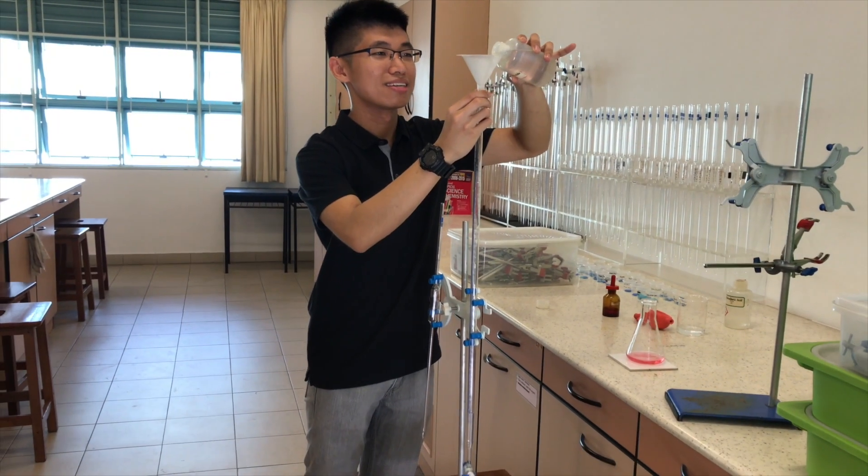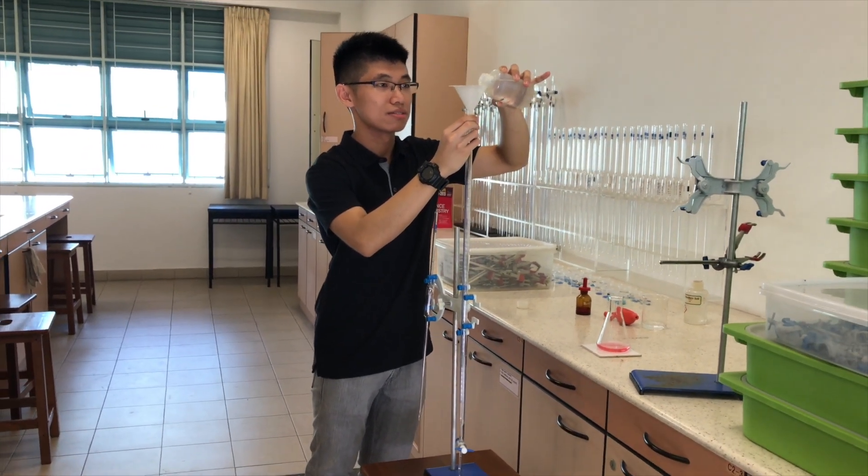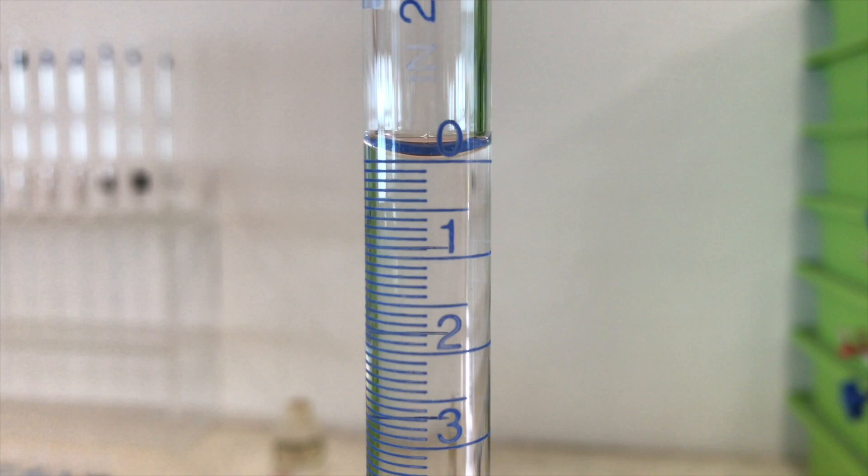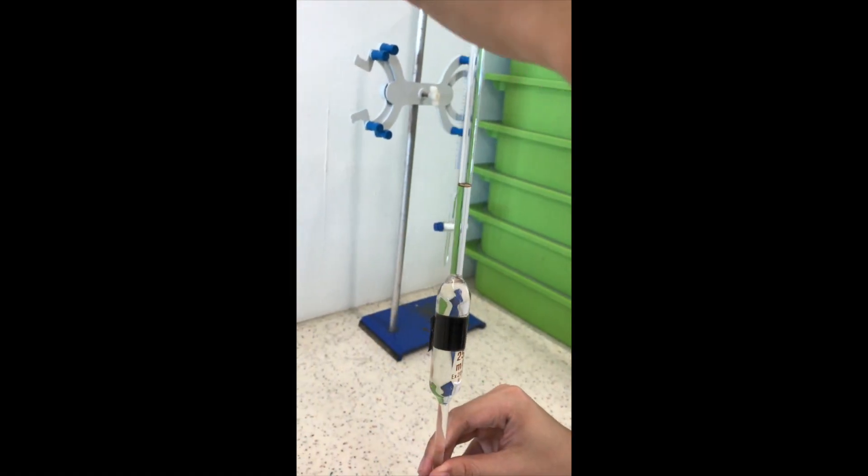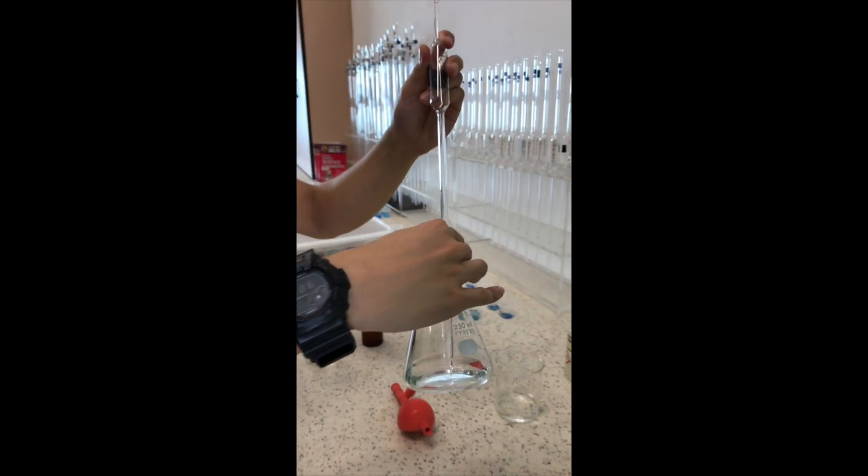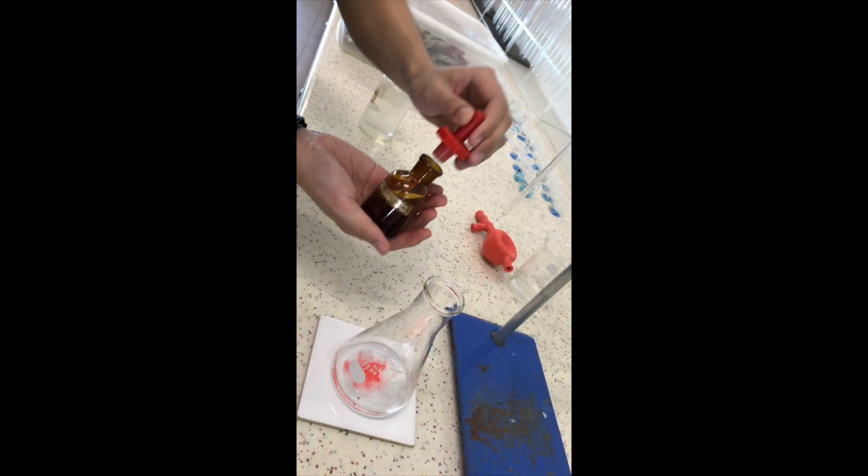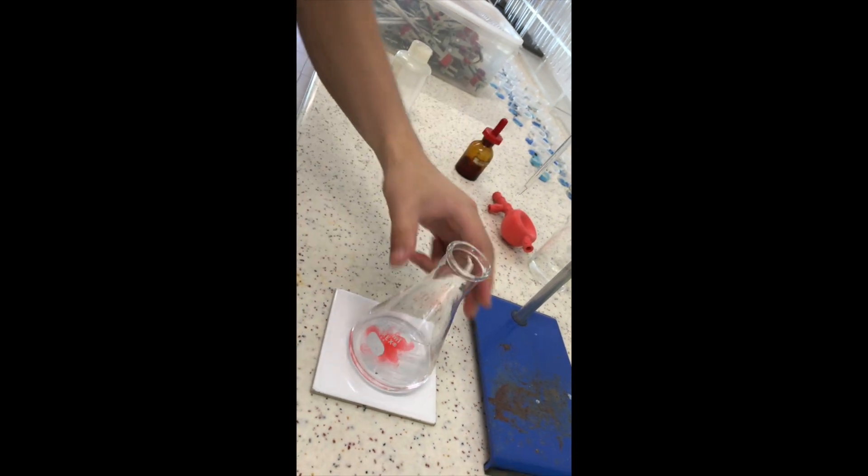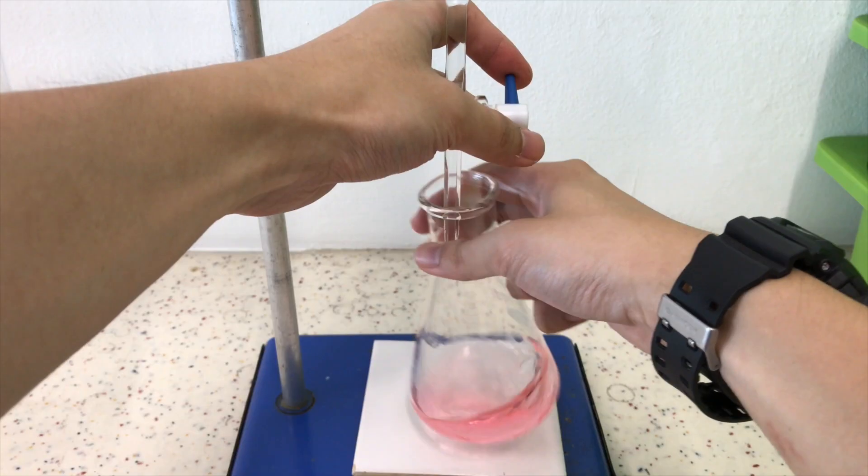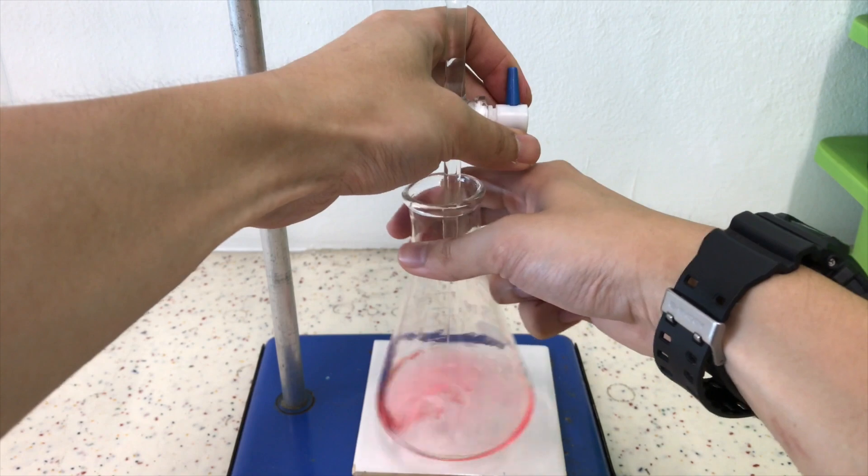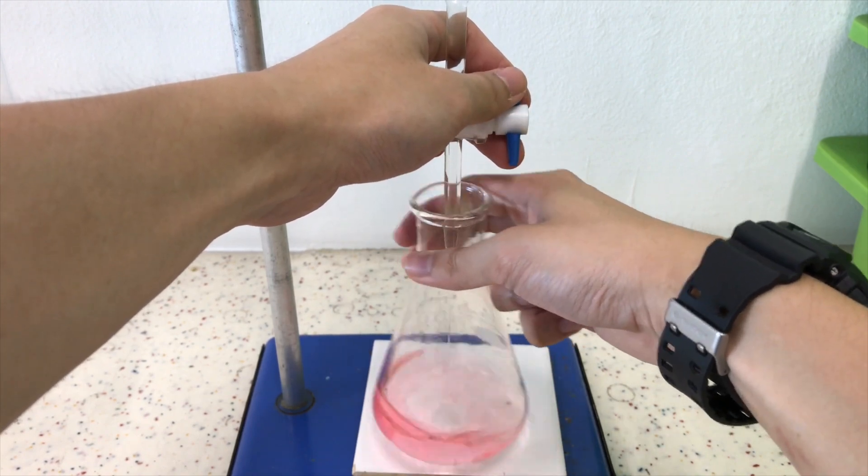Step one: we fill a burette with sodium hydroxide and take note of the initial reading. We will pipette a fixed volume of acid into the conical flask, usually we use 25.0. Always remember to add the indicator because that will tell us how much of the alkali we will need for complete neutralization.